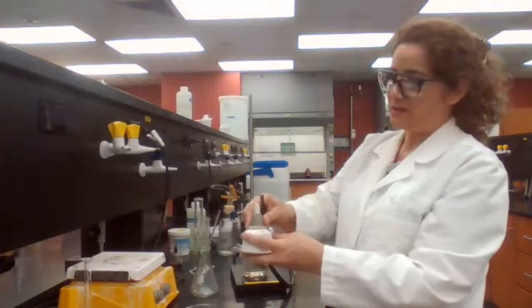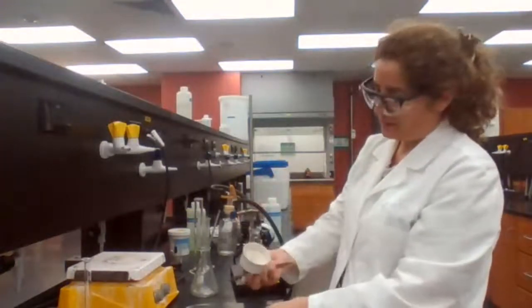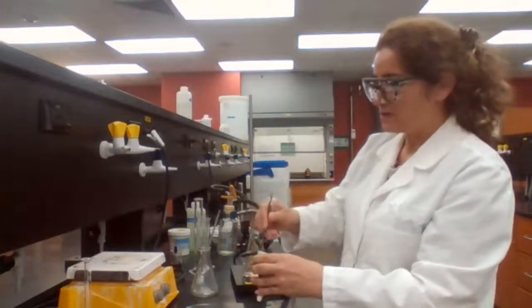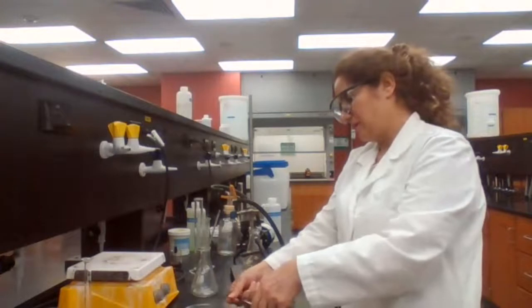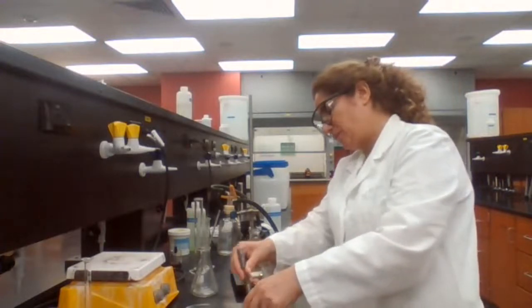Other times you can just slide it and get the filter paper, like the cooking paper underneath. You slide it, take it out of the container and place it on the watch glass.